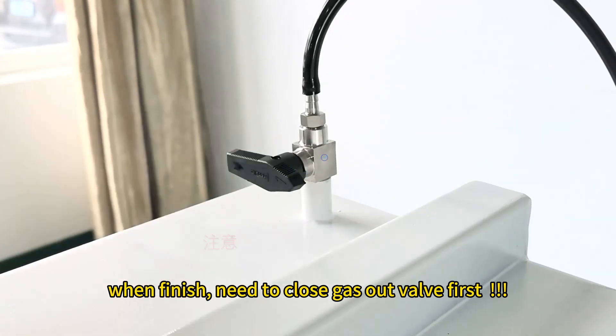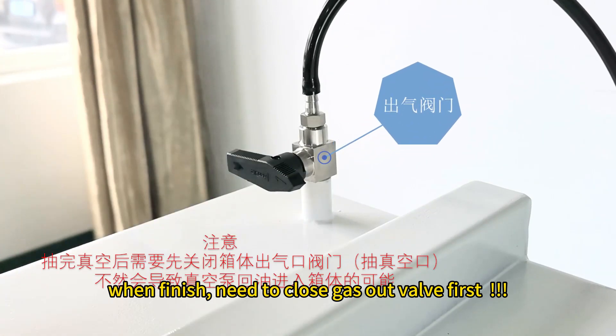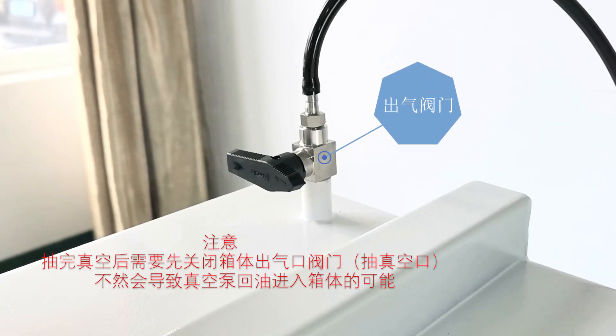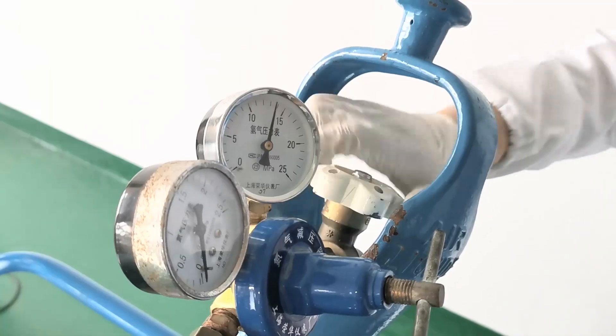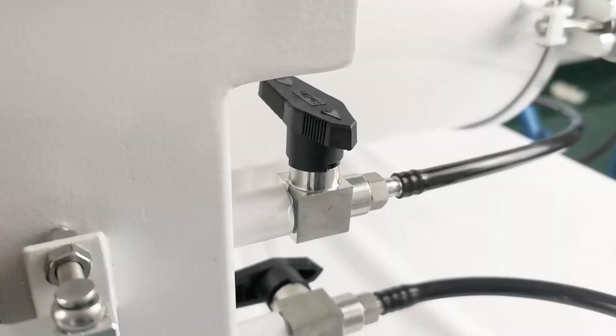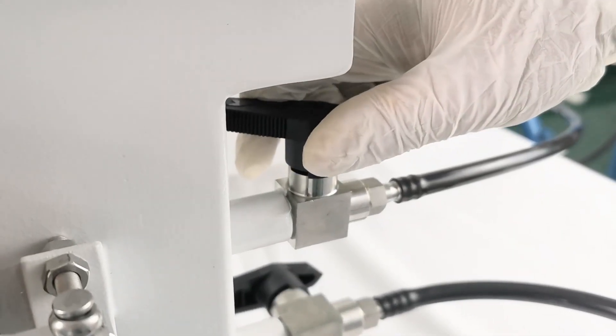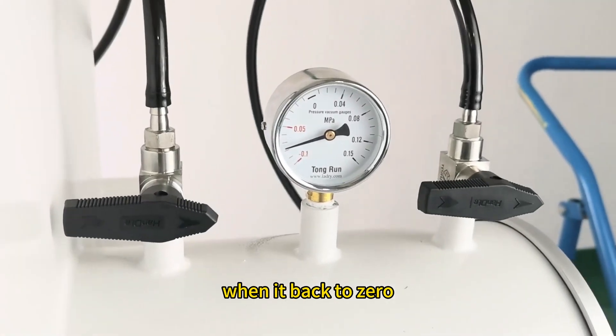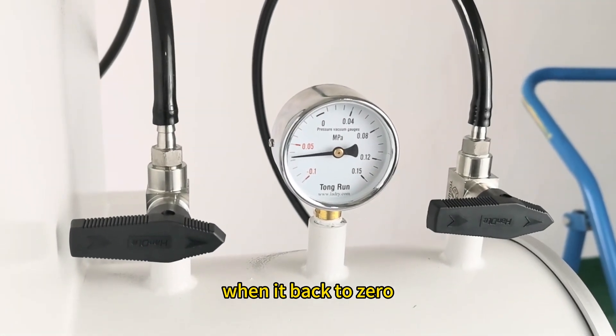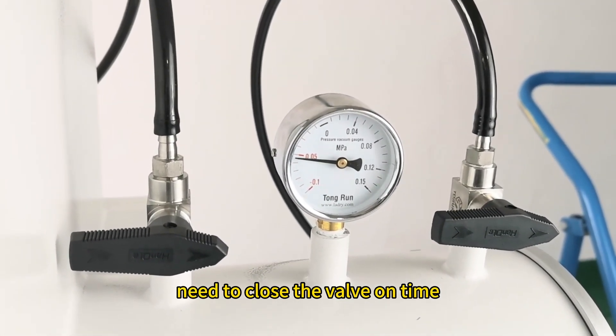When finished, need to close the gas outlet valve first, then close the vacuum pump. Open the gas inlet valve — the gas refill speed is very quick. When the pressure returns to zero, close the valve on time.